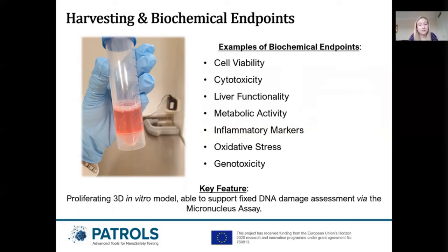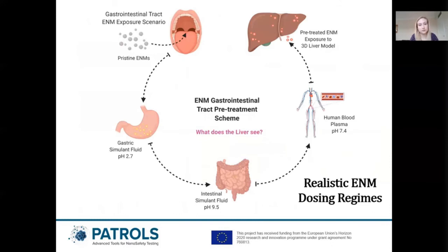However, for cell-based assays, more plates may be required per dose depending on how many cells the assay requires. One key feature of this model, though, is that it is able to support fixed DNA damage assessment using the micronucleus assay, as it does remain proliferating throughout 14 days in culture.